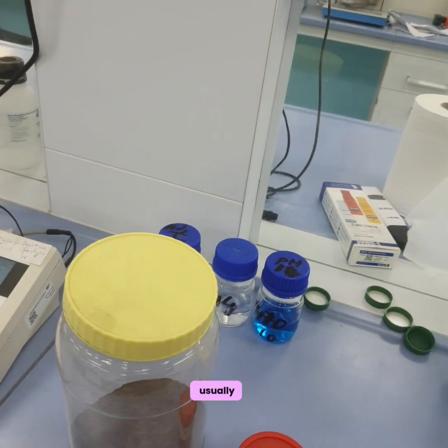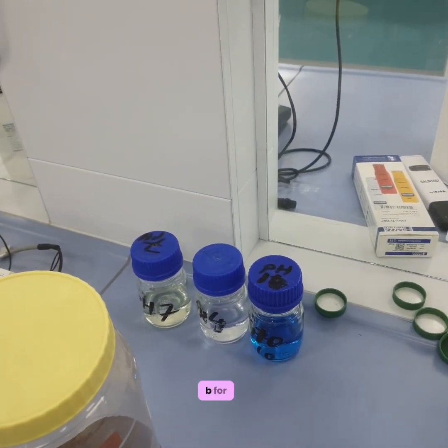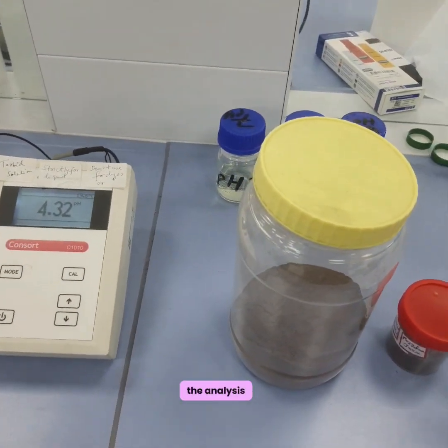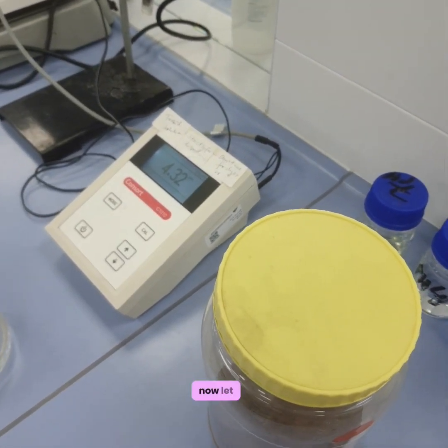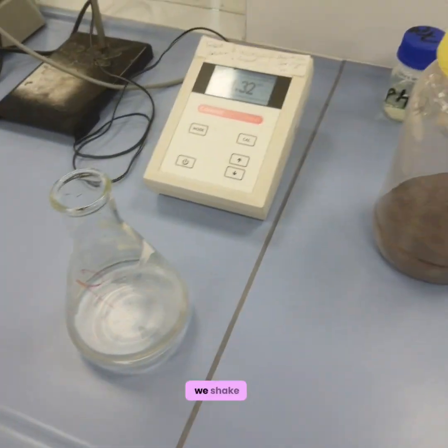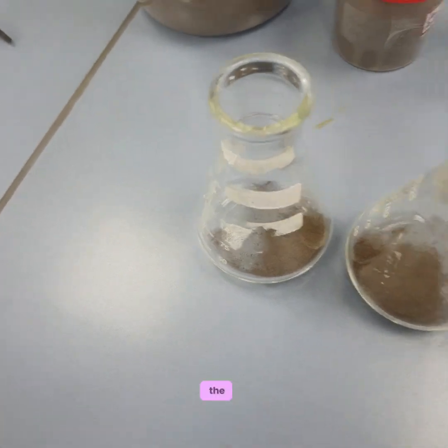Usually the US EPA method is 9045D for soil and waste, the analysis for pH. So this is 9045D. Now let us start the measurement of the pH. Let's weigh, and then we shake it for around 5 minutes. We transferred the required amount of the volcanic ash.